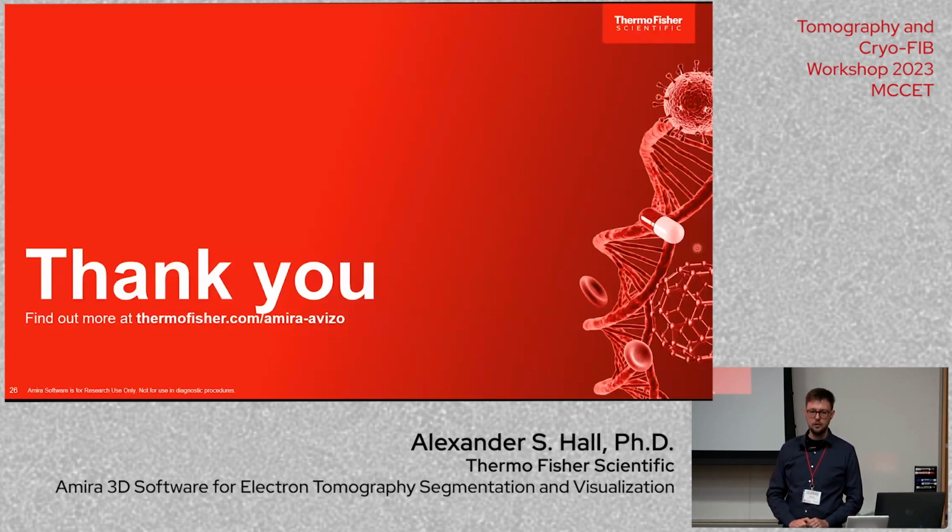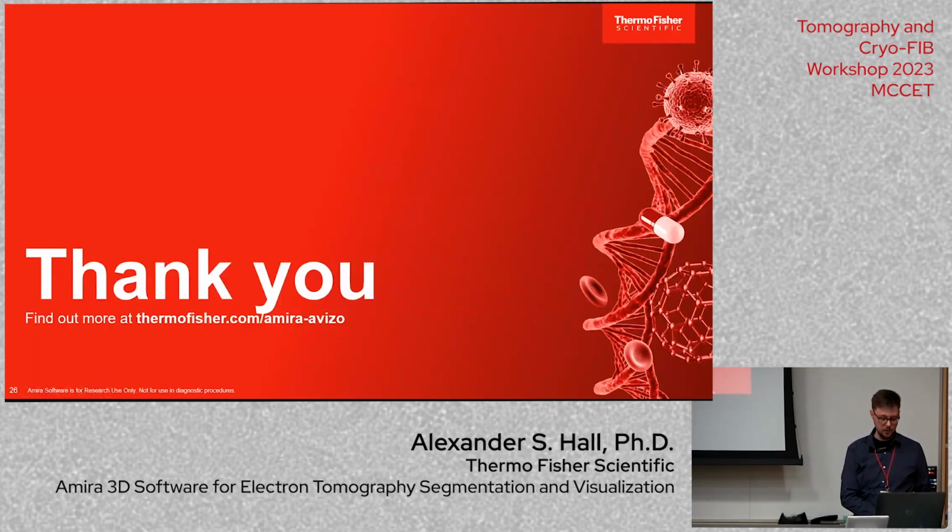Yeah, two good questions. So the first question was, in the case of actin, you're just saying actin filaments, right? Okay. So actin filaments are much smaller than microtubules. At the resolution of cryo-electron tomography, they're not going to show up as cleanly. In that case, because they're more or less tube-like, or filament-like, there's a technology that I showed for the focused ion beam data of the muscle tissue.